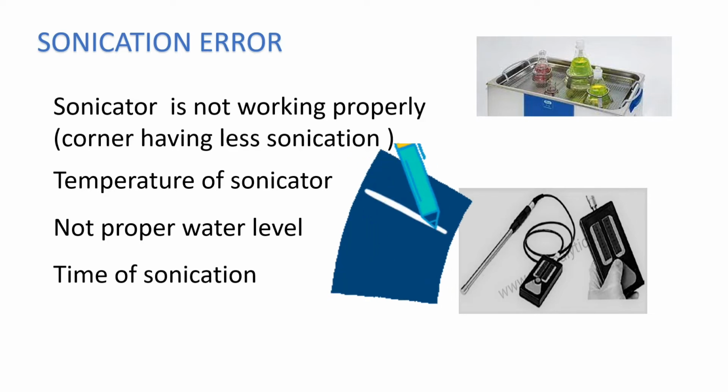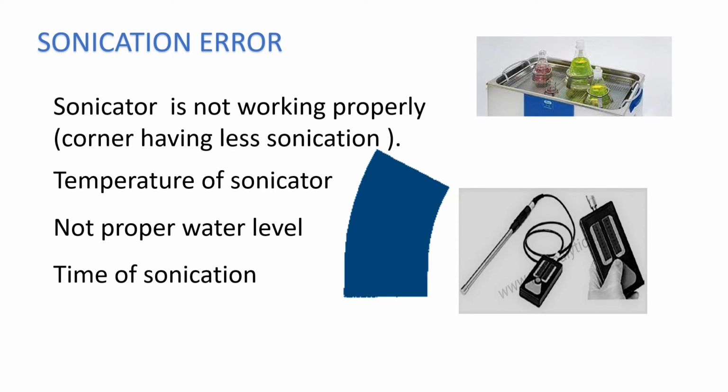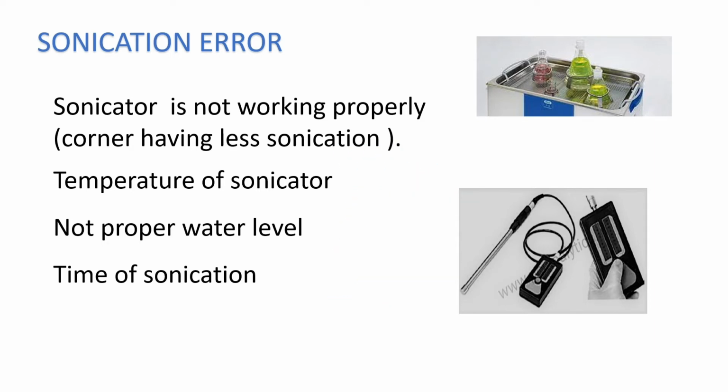You cannot write just 10 minutes, because in the STP it is mentioned the sonication has to be done for 10 minutes, and the worksheet and test data is always copy-pasted from the STP. So people write only 10 minutes. No, this is not correct. You can write when you started the sonication and when you ended the sonication. So start time and end time have to be in the worksheet and test data sheet.